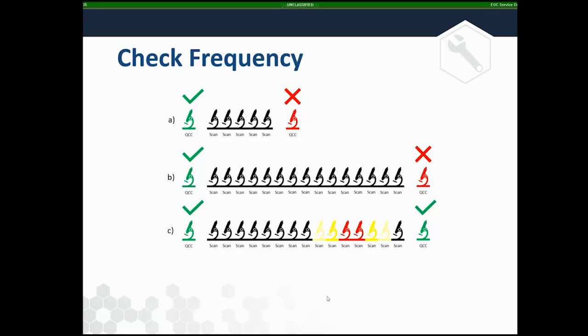And so you start to do it every week, and then maybe that's going really well too. And so you think maybe that's not that important. We could just do this every month. And I can see where maybe there would be a temptation to do that. But at the same time, making sure that you're consistent, and obviously you wouldn't want to do maybe 10 checks on a single instrument each time. But if you have that performance check that's pretty accessible, it's pretty similar to the scanning that you're doing anyway, a really regular check frequency is going to be really important.